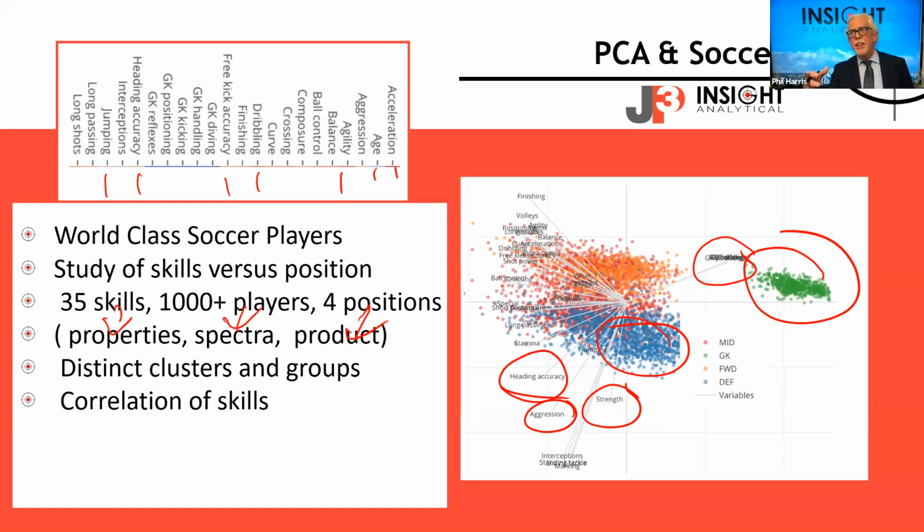So one of the things that happens with these inferential analyzers, where we have to build models around it, is we want to make sure that we've taken enough samples for the different products that are likely to go by. The good news is these types of models can usually give you a statistical predictor of how well they're fitting.